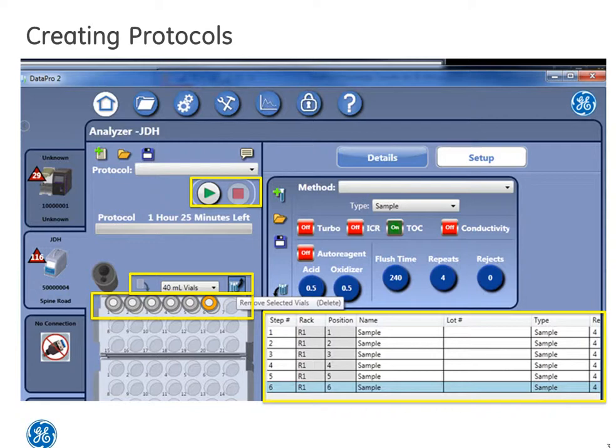Oh, and one last thing. You now have a graphic display of how much time the protocol will take. This is a great feature for analysts that are on tight timelines for sample turnaround.